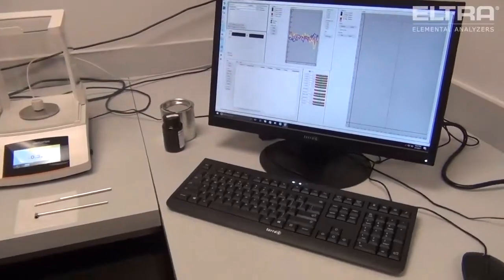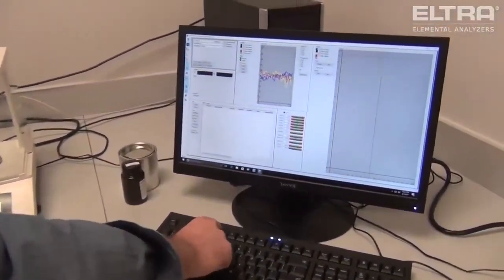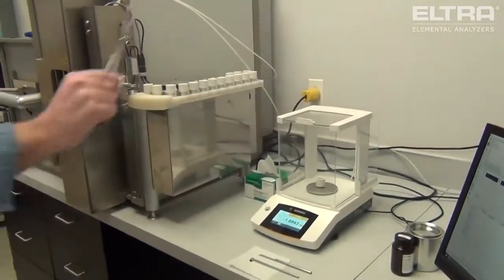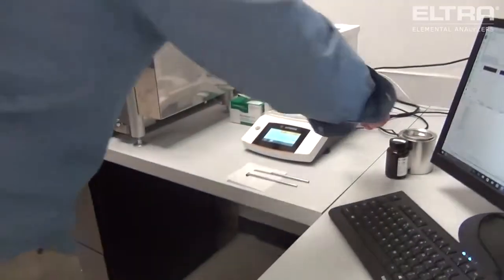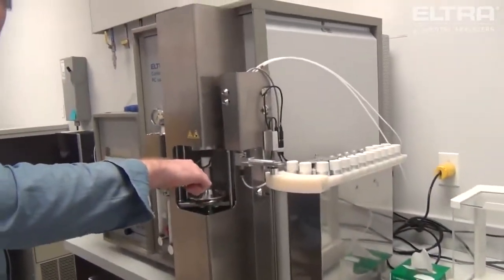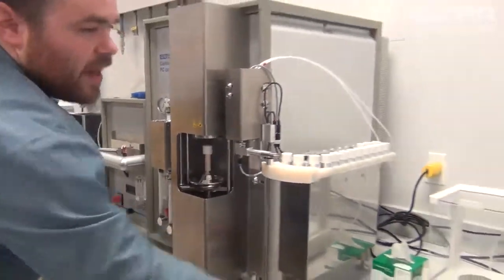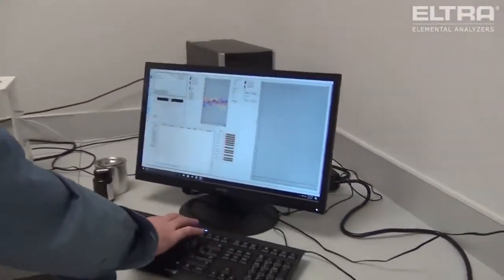Transferring the sample weight to the PC is as easy as pressing F4. Now that the software has the weight for the sample, we will now take the crucible, put it onto the pedestal, and starting an analysis is as easy as pressing F5.